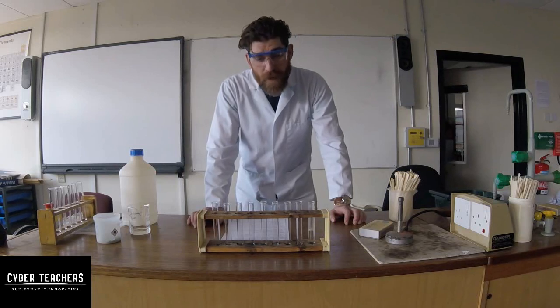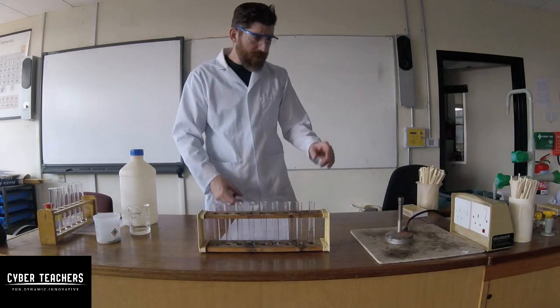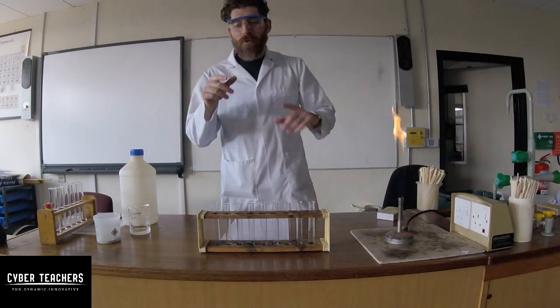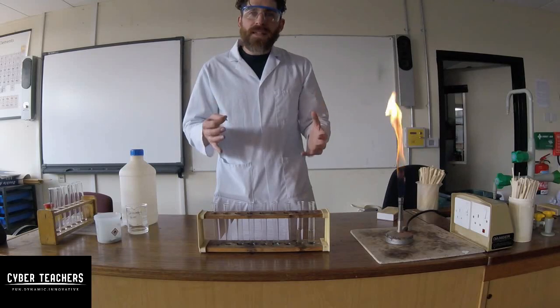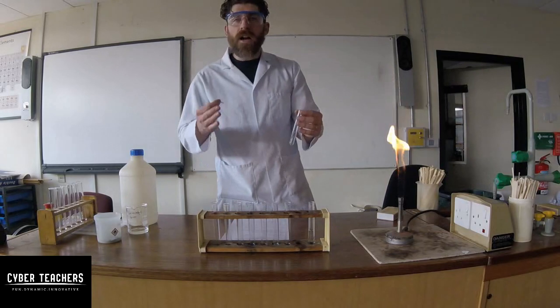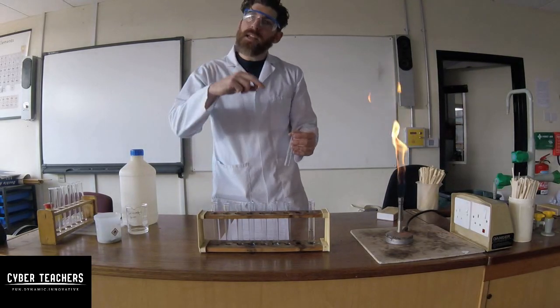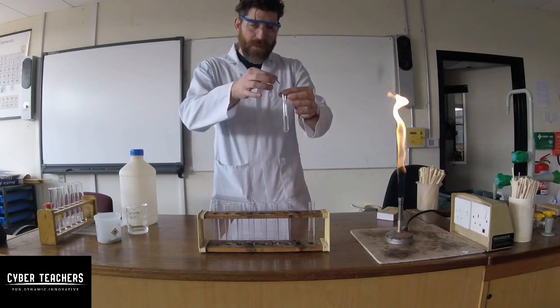There was a gas being given off — the question is what was that gas? We can test it, but we need to collect some first. I think it's hydrogen. Hydrogen is lighter than air, so I can place a test tube over the top and it will rise up into it. Let's have a go.